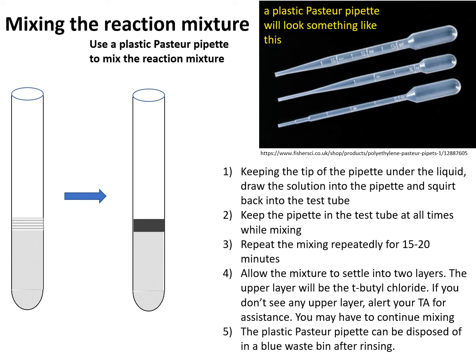specifically called the squirting technique.